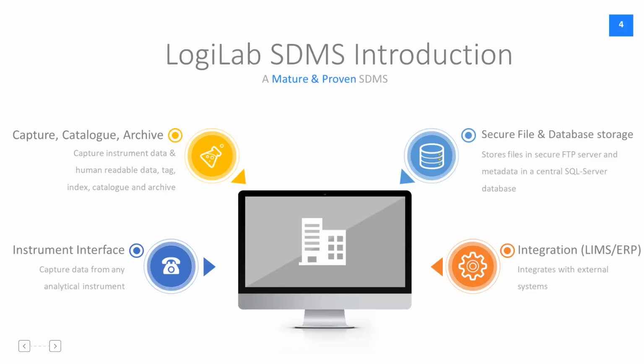Logilab SDMS is a mature and proven scientific data management system. It has been designed mainly to capture, catalog, archive instrument raw data and metadata along with human readable data and tag data in a manner such that the data can be indexed, cataloged and archived for long-term purposes.